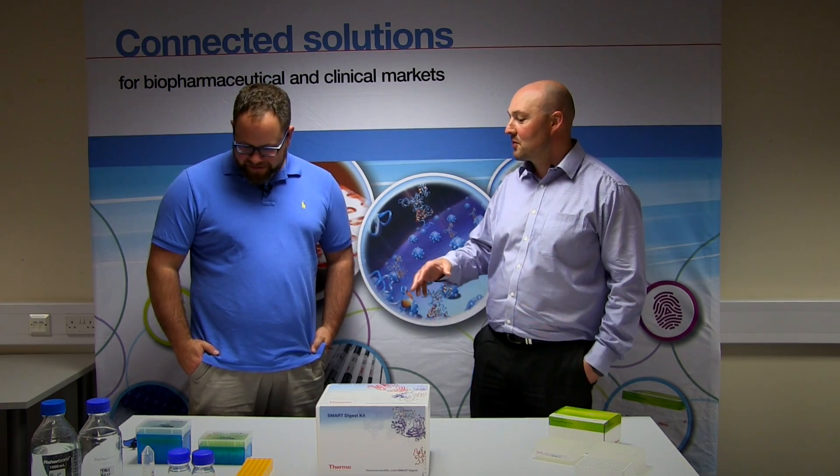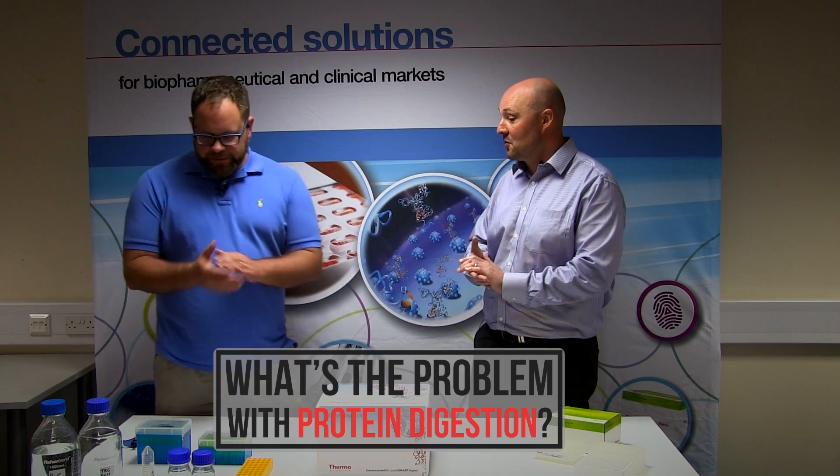So today what I'm going to do is run through some of the processes that some of our customers come across. We're going to show some of the pain points they come up against when doing In-Solution Digest Protocols. I'm going to run through an overview of how you would normally perform an In-Solution Digest Protocol.